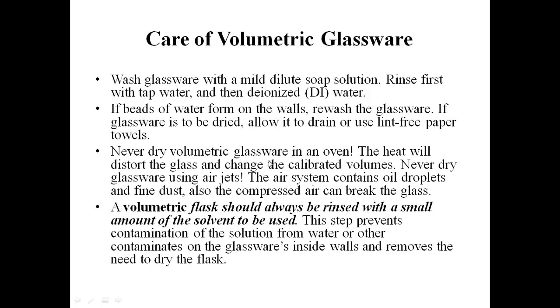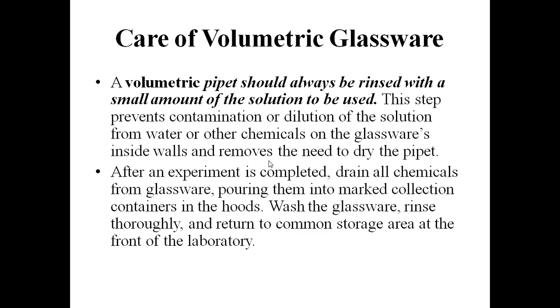Never dry volumetric glassware in an oven, because the heat will distort the shape of the glass and change the calibrated volumes. Never dry glassware using an air jet, because an air jet may contain oil droplets and fine dust, and also the compressed air can break the glass. A volumetric flask should always be rinsed with a small amount of the solvent to be used. This step prevents contamination of the solution from water or other contaminants on the glassware's inside walls and removes the need to dry the flask.